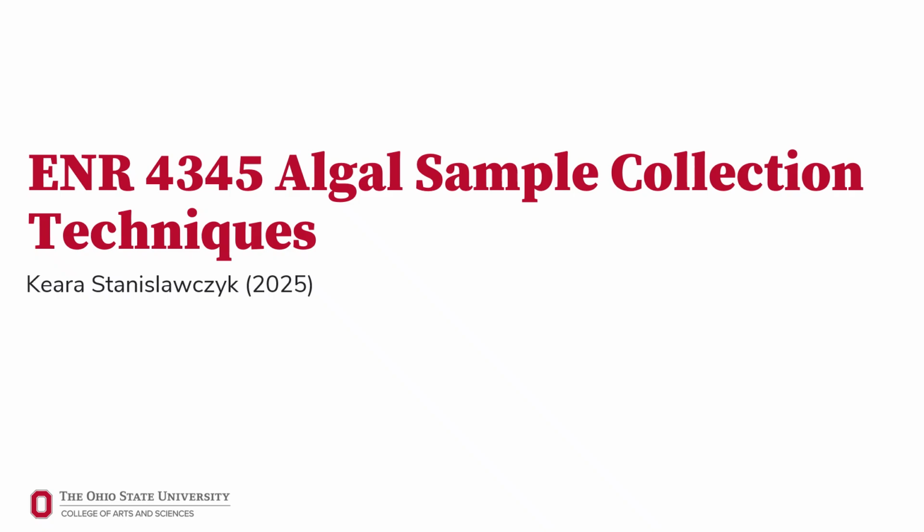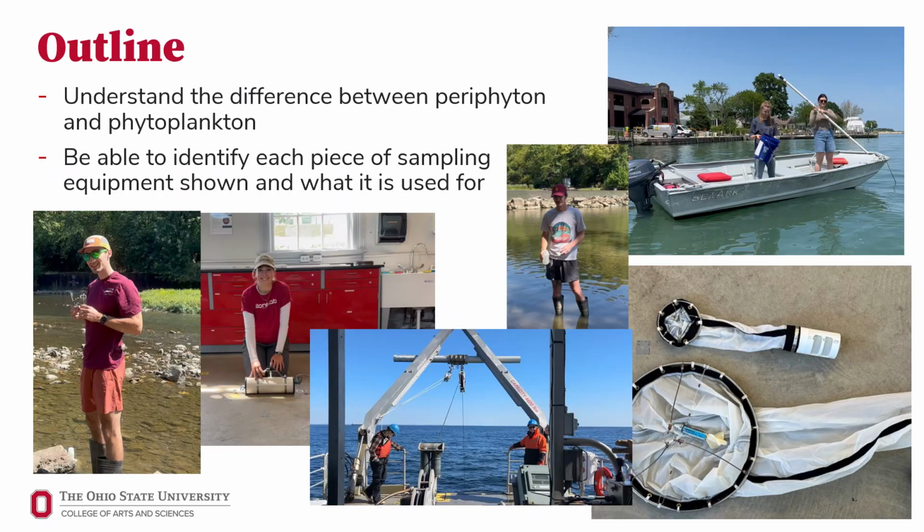This is the Algal Sample Collection Techniques lecture for ENR4345, Methods in Aquatic Ecology course at The Ohio State University. In this lecture, I will define periphyton and phytoplankton. I will then go over several different pieces of sampling equipment and how to use each of them.